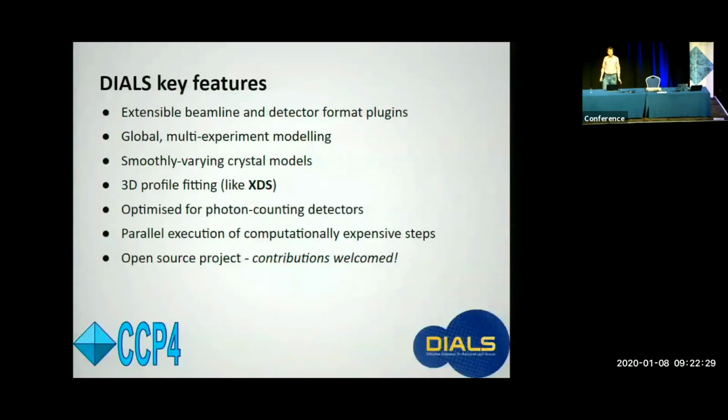So, a little reminder about the key features of the DIALS package. It's a diffraction integration software. We've got a model for extensible beamline and detector format plugins, so you can adapt DIALS to unusual beamlines quite easily.